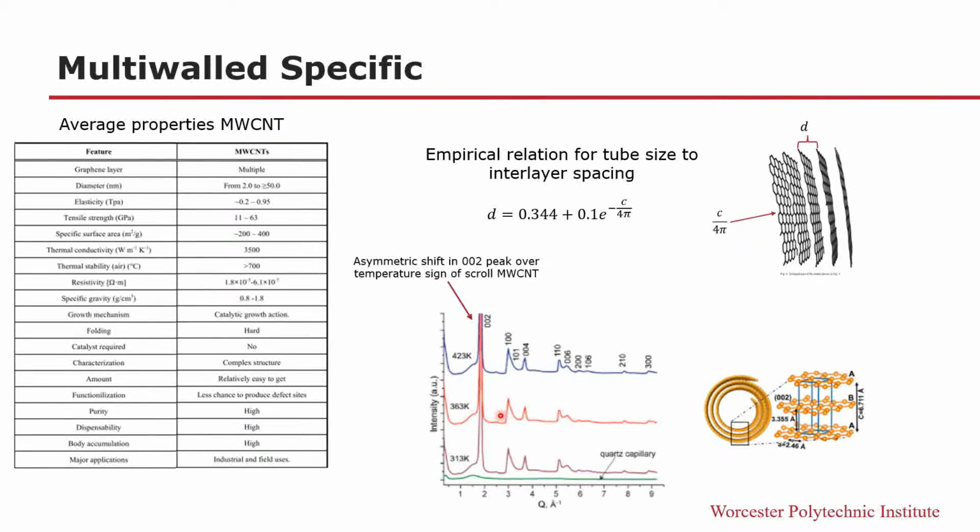As can be seen here, the 002 peak shifts as you increase in temperature.